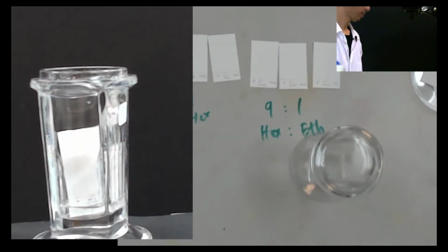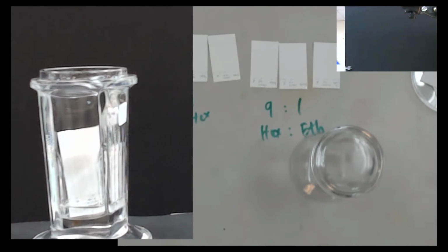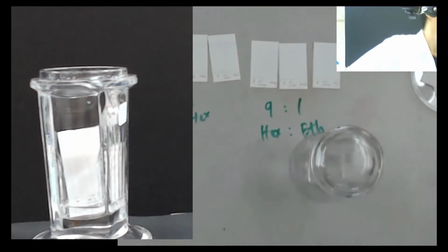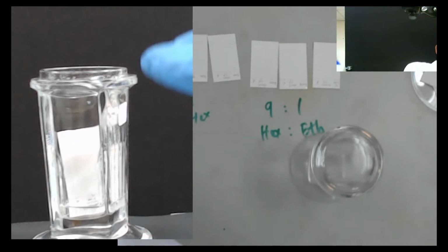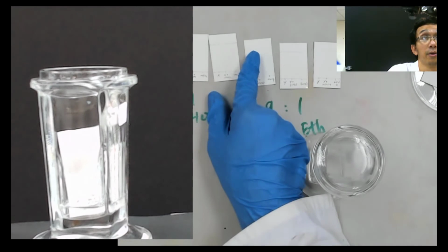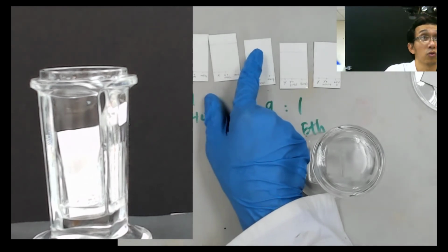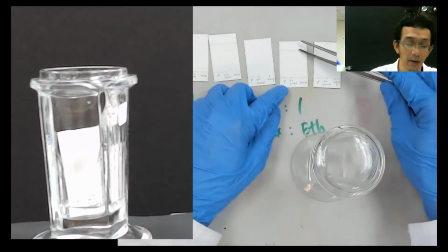Wait, no, I need to wait first. Because now the water, not the water, the solvent rises up, and we need to stop until it reaches the top. Okay. So I need to stop there, but I cannot move first because once it goes here, then we need to stop.